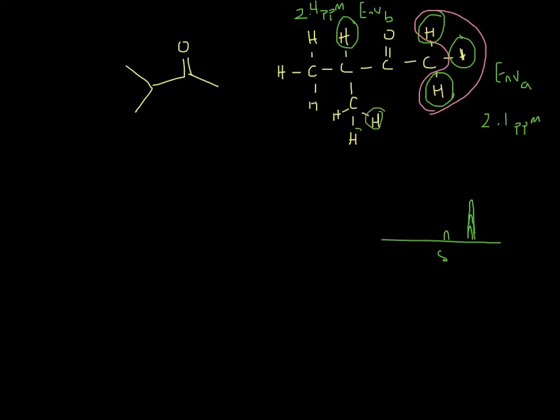I've got three hydrogens here, and I probably don't need to convince you that they're all going to be the same. So these are hydrogens next to a carbon with two hydrogens, next to a carbon with one hydrogen, that's next to a carbonyl. You can count those out and think about this the same way that we tracked hydrogens when trying to figure out E or Z, or R and S, and we ranked them. But instead, just walk their pathway and see how far they are away from things. If you examine all three of these, you would find that all three of them are exactly the same. So I'm going to say that these are in environment C.